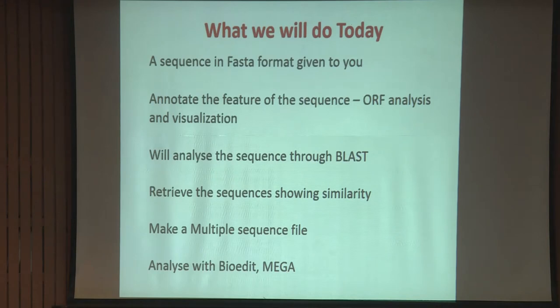I think submission has been done. So before submission, you have to annotate your sequence with different genes, different ORFs, and then submit the sequence. After submission, you have to analyze this sequence through BLAST, retrieve the sequences showing similarity from the BLAST, then make a multiple sequence file, and then analyze with two different software, BioEdit and MEGA. So this is what we have been teaching you.